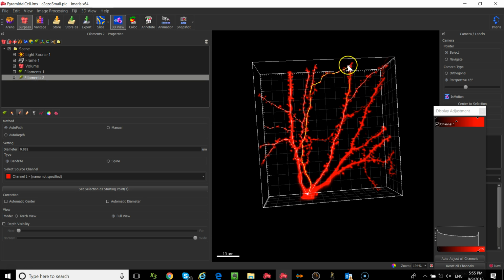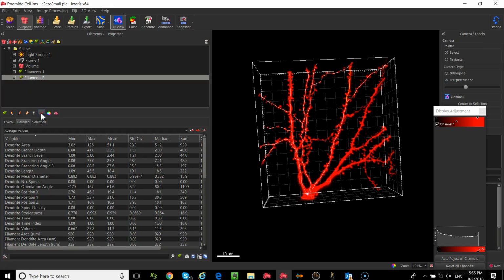Now, what I did want to show you is all the statistics are already calculated. As you're tracing, it's automatically calculating all the branching, all of the information that you need for the purpose of tracing. Okay. How big is the data that you're potentially looking at?